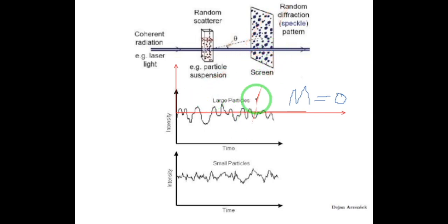The system here is now at equilibrium, which means that at any given time, the mean value of the light intensity is going to be the same, no matter whether you have this set of data until here or this set of data until here.